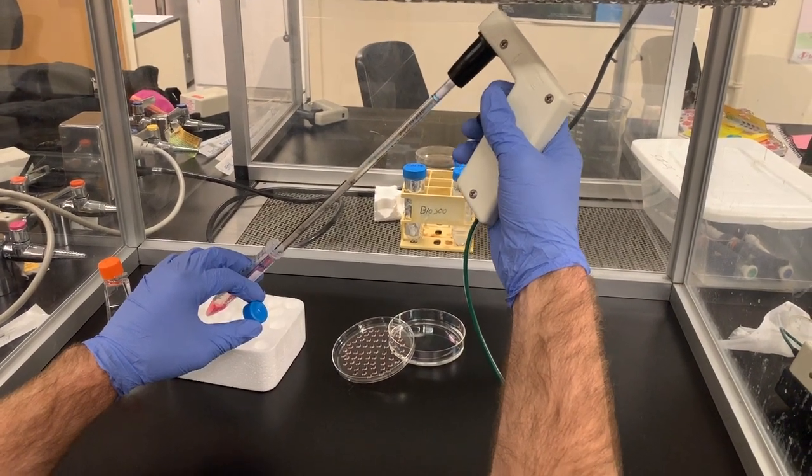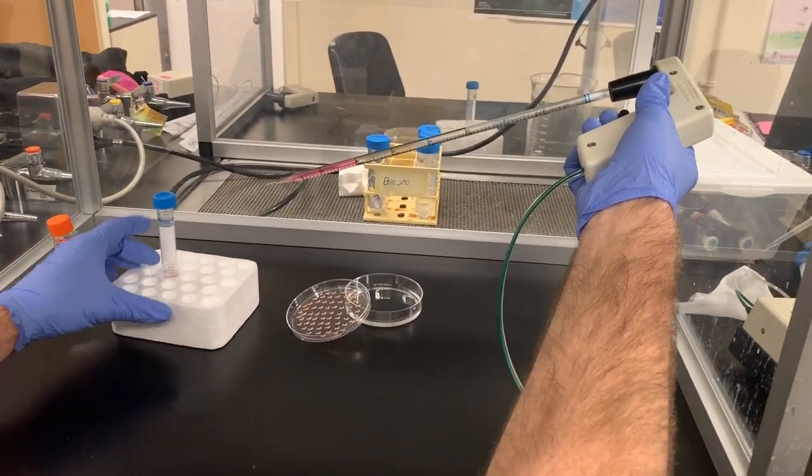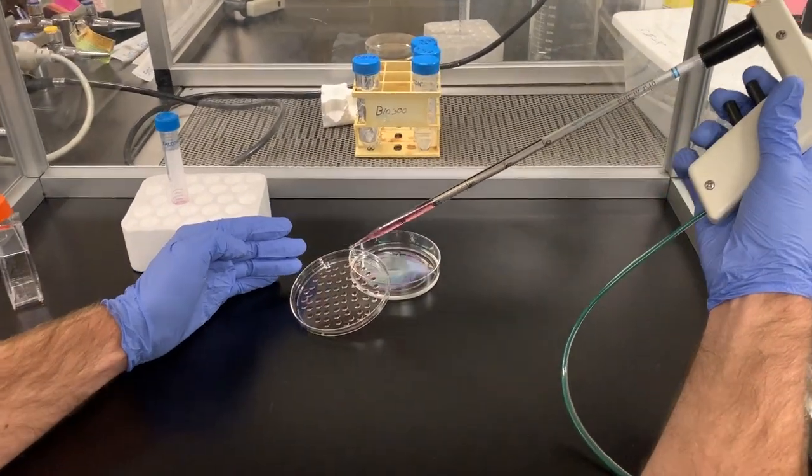Carefully remove your hanging drop plates from incubation and place in a tissue culture hood. Remove the lid of the plate containing the drops that were plated in the previous lab.